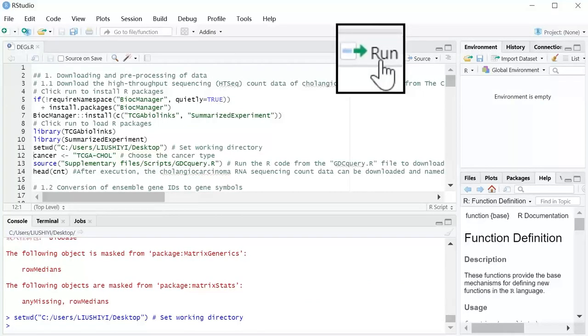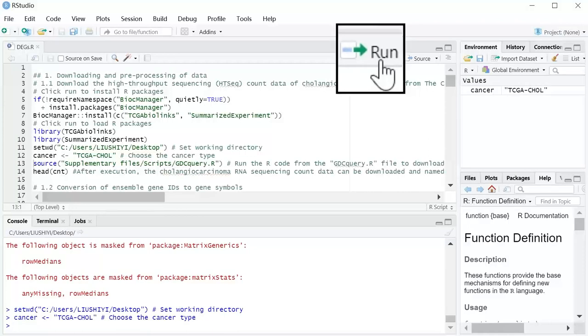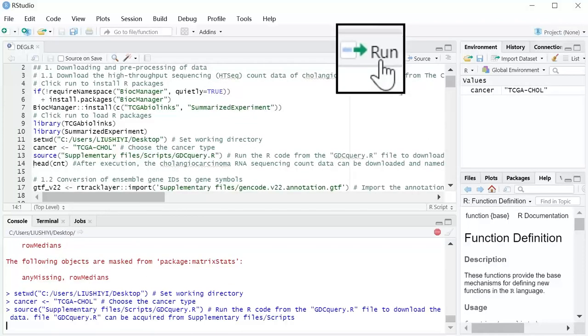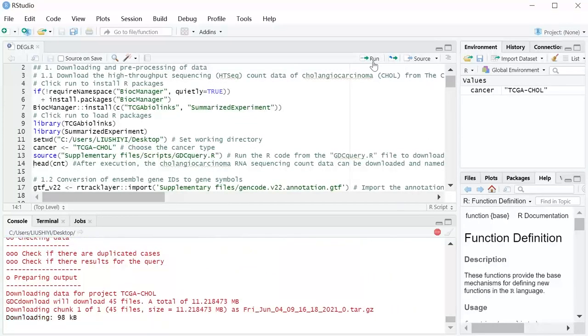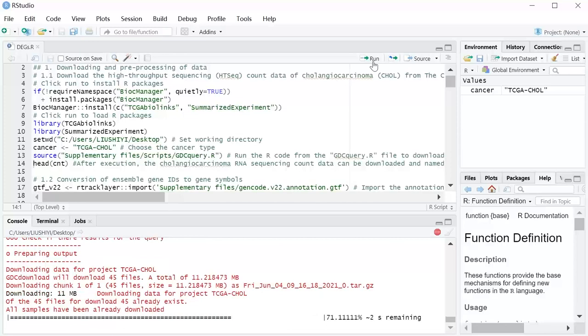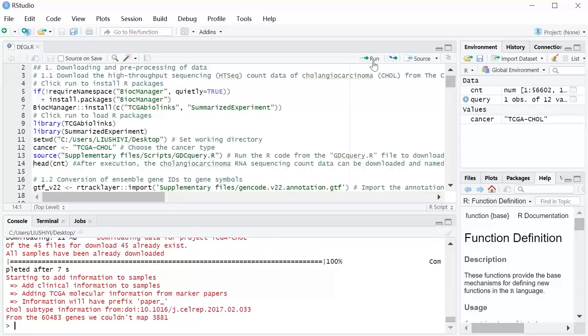Choose the cancer type. Run the R code from the GDCquery file to download the data. The GDCquery file can be acquired from supplementary files.